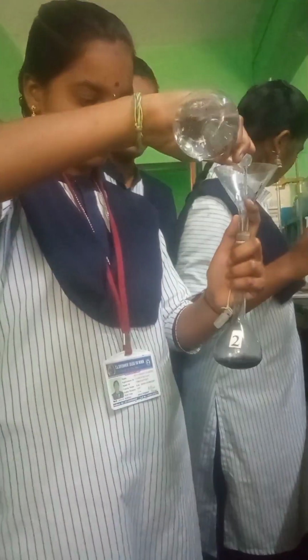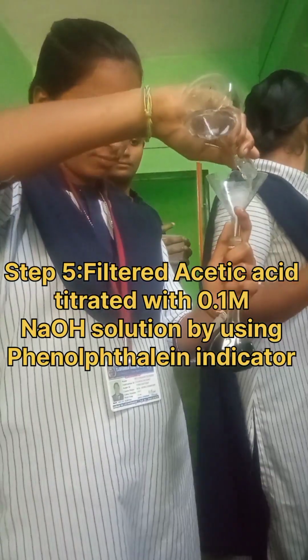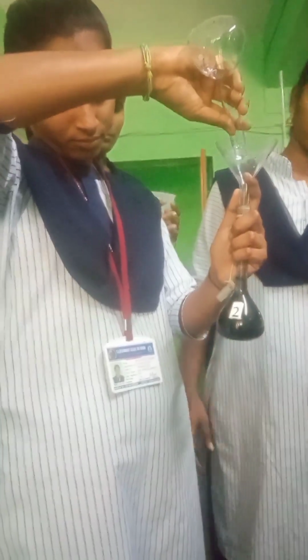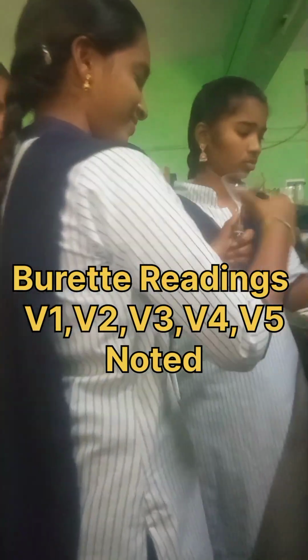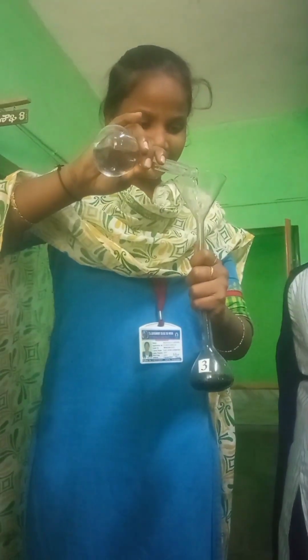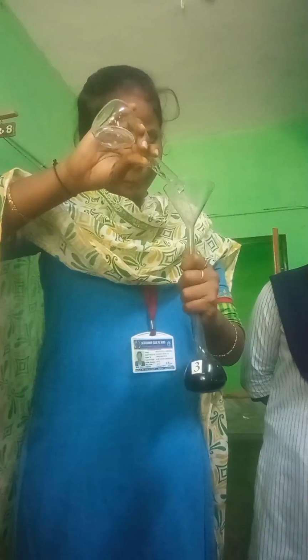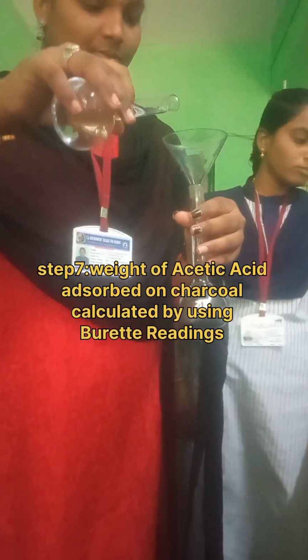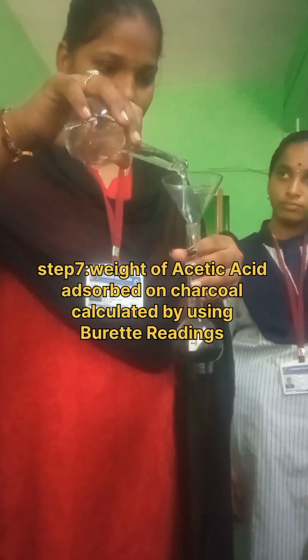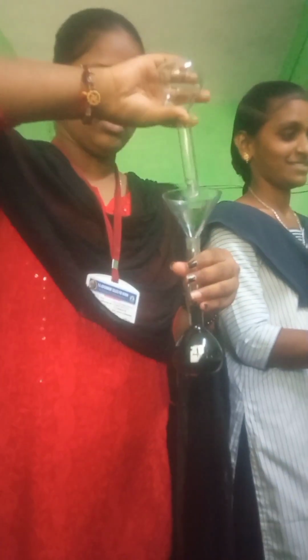After standing for a few hours, these flasks are filtered into labeled or numbered boiling test tubes. The filtered acetic acid is taken, added with phenolphthalein, and titrated against 0.1 M NaOH.